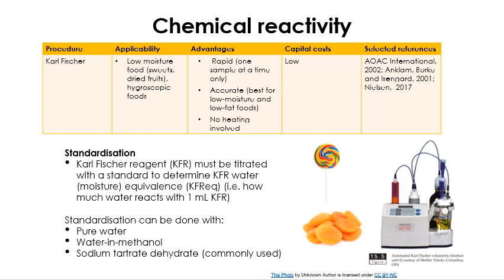This is to know how much water reacts with 1 ml of the Karl Fischer reagent. The standardization can be done using either pure water, water in methanol, or the most commonly used solution, sodium tartrate dihydrate.